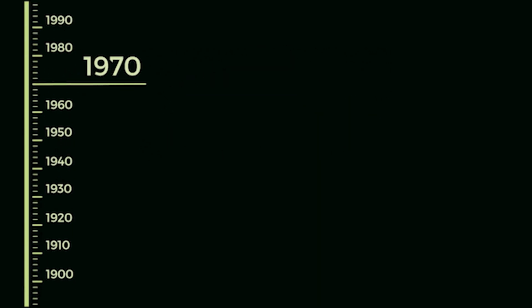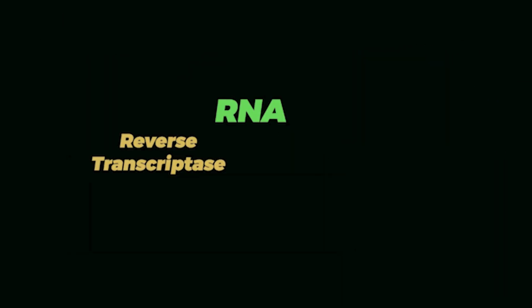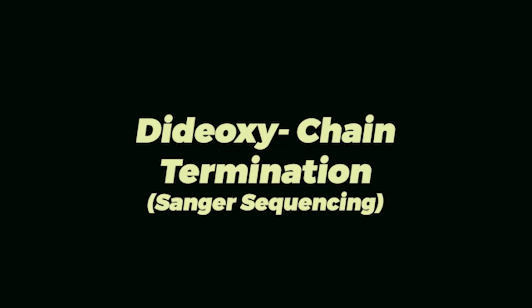In the 1970s, scientists Howard Temin and David Baltimore simultaneously discovered the enzyme reverse transcriptase. This enzyme generates complementary DNA from an RNA template. This is particularly useful because DNA is much more stable than RNA. Consequentially, DNA sequencing technologies like dideoxy chain termination, RT-qPCR, and probe hybridized microarrays, which pave the path for high-throughput DNA sequencing, can be used for RNA detection.